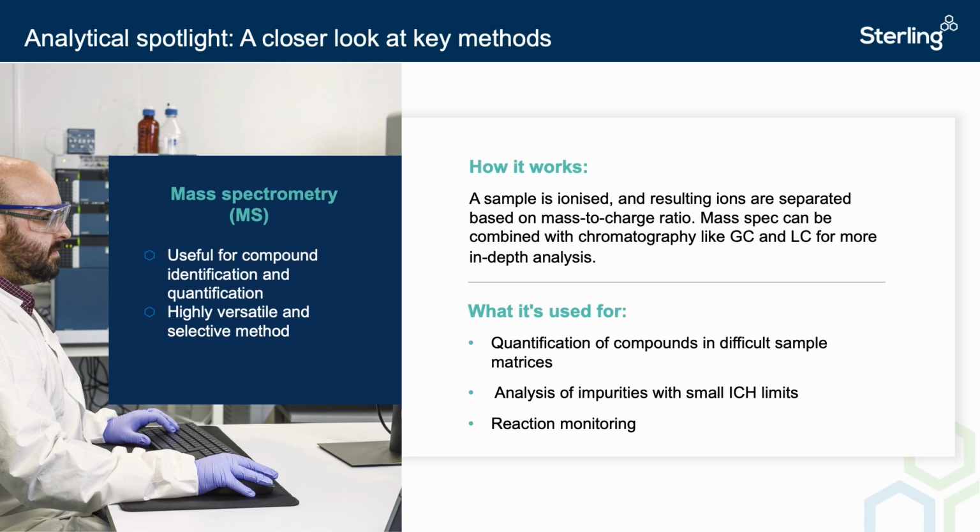Mass spectrometry is an incredibly powerful technique that allows for the identification and characterization of compounds, both known and unknown, especially when used in tandem with chromatographic methods like LC or GC. Chromatography on its own only separates mixtures and aids in the quantitation of compounds. Mass spec can provide structural and spectral information that enables the identification of compounds and provides details to the structure of unknowns.